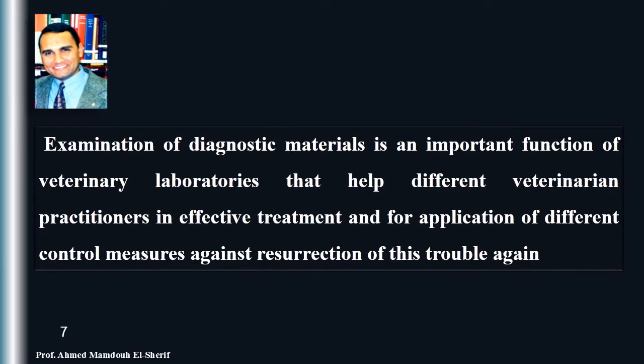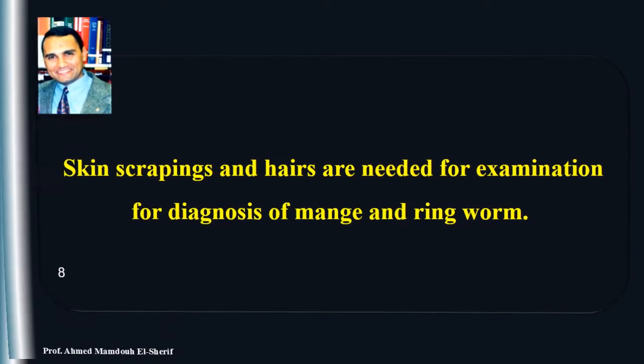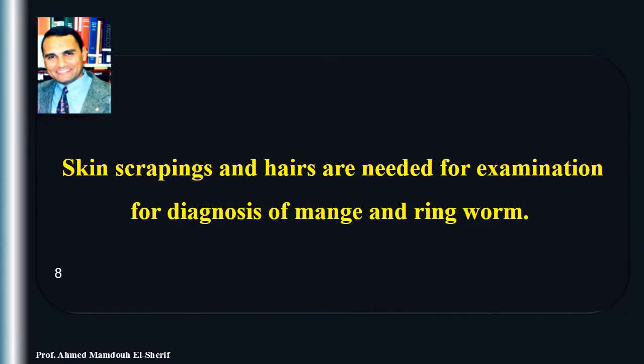Examination of diagnostic materials is an important function of veterinary laboratories that help veterinary practitioners in effective treatment and in application of different control measures against recurrence of this trouble again. Skin scrapings and hairs are needed for examination for diagnosis of mange and or ringworm.